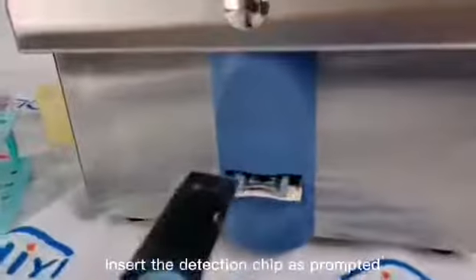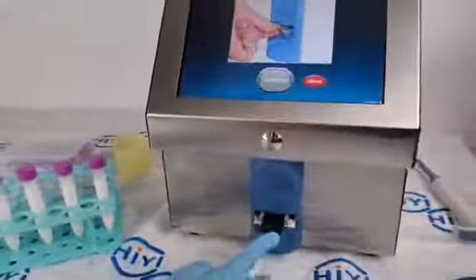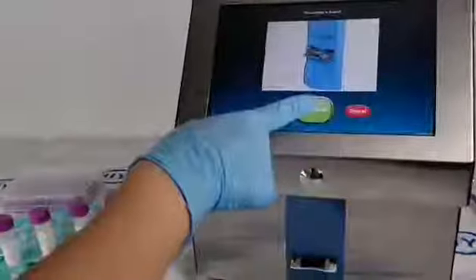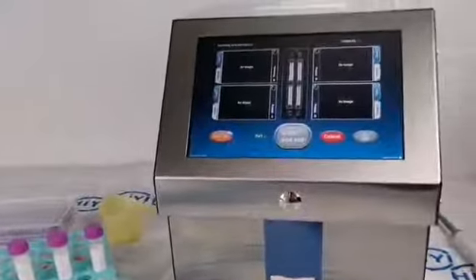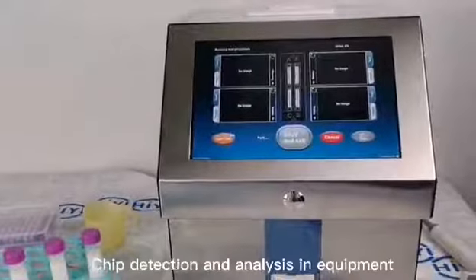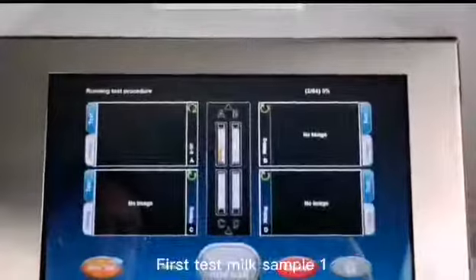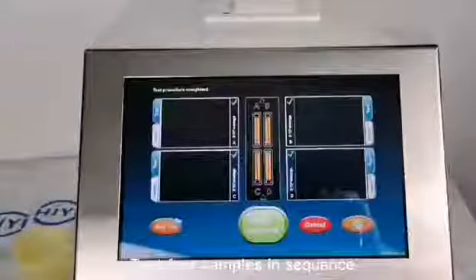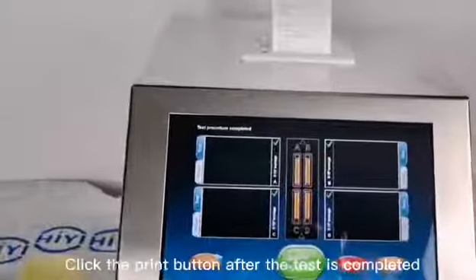Insert the detection chip as prompted. Click the continue detection button. Chip detection and analysis in equipment. First test milk sample one, then test samples in sequence. Click the print button after the test is completed.